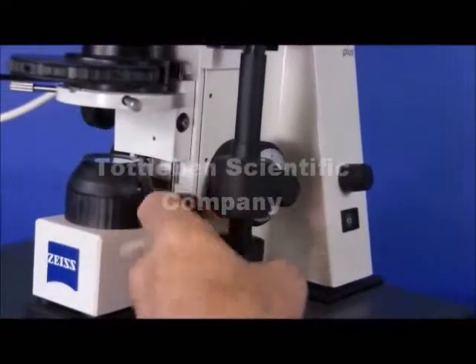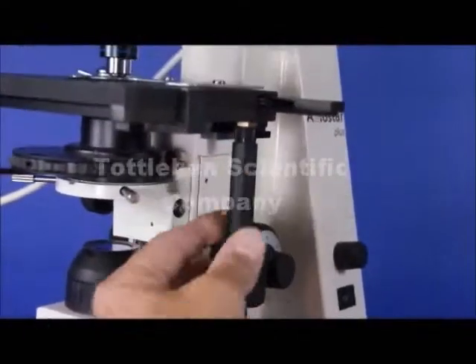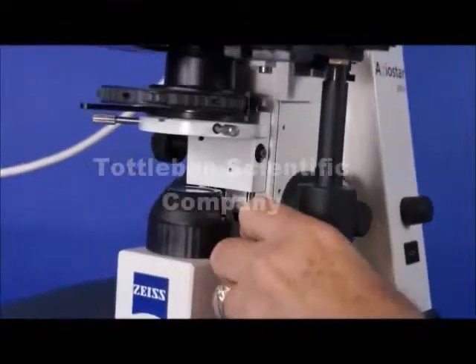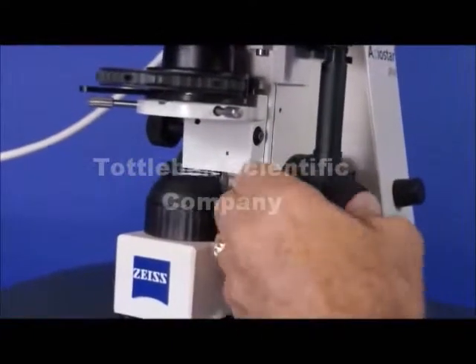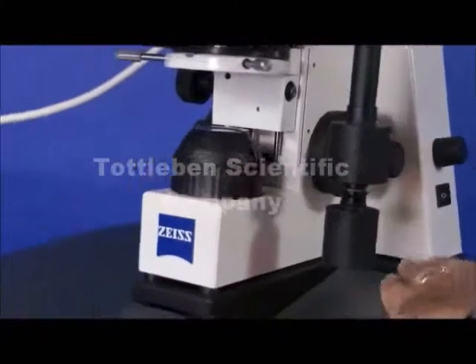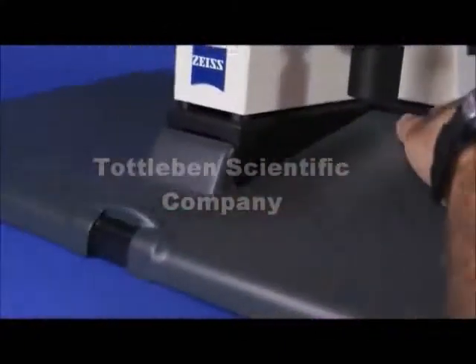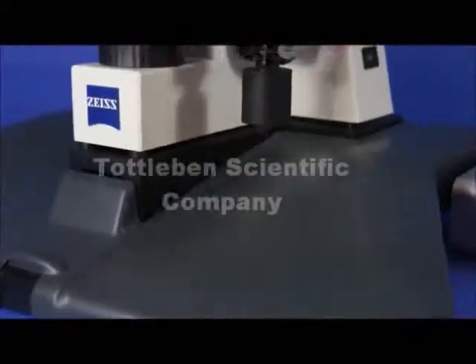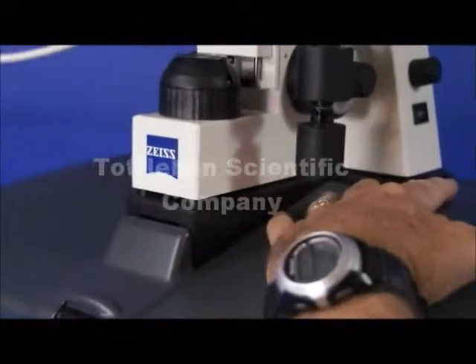The stage is outfitted with low position coaxial drive so that you can do XY mechanical movement very easily and very comfortably. This microscope is also equipped with an ergo stand for ease of use — it's nice and curved to fit the format of your arms when your arms are placed there for focusing.